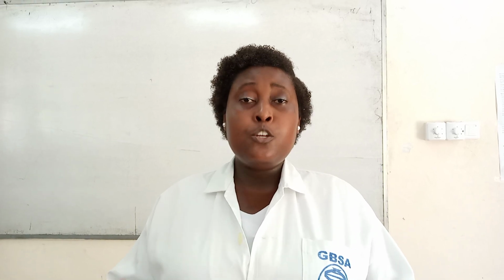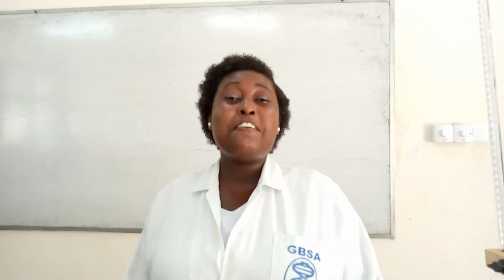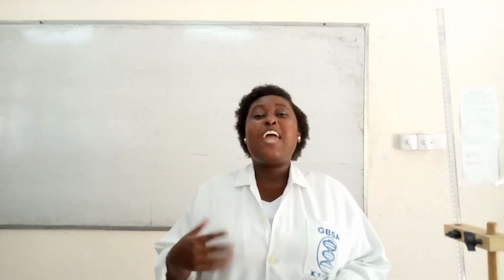So guys, this is a summary or a brief explanation of what we'll be doing today. Now I will not be doing this. I have a colleague here who will be joining me. So my colleague La, please can you come and join me here? So he is a very fine gentleman who is one of my colleagues here. He will demonstrate all that I've said in English and he is going to demonstrate for us to see.